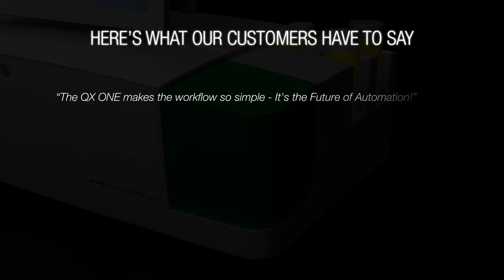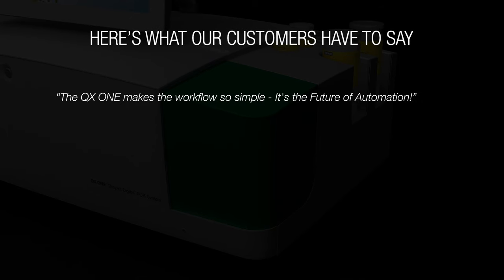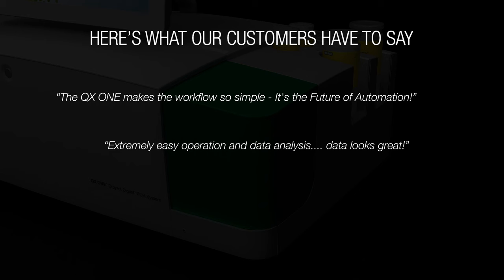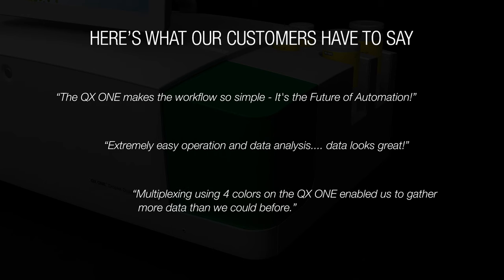The QX1 makes the workflow so simple. It's the future of automation. Extremely easy operation and data analysis. Data looks great. Multiplexing using four colors on the QX1 enable us to gather more data than we could before.